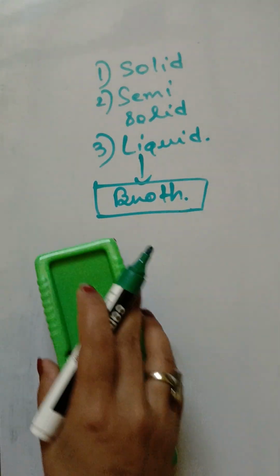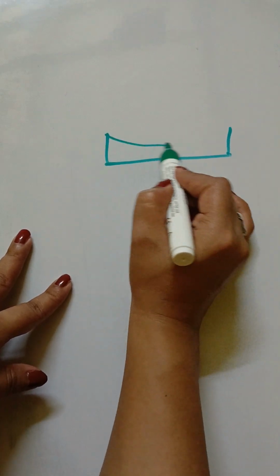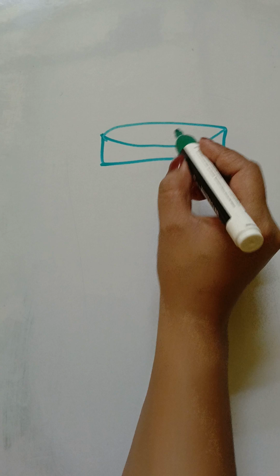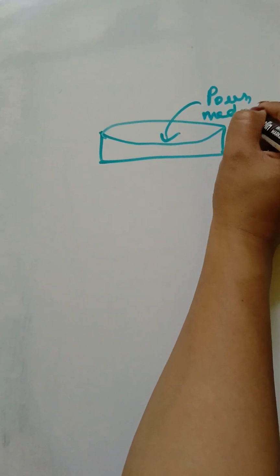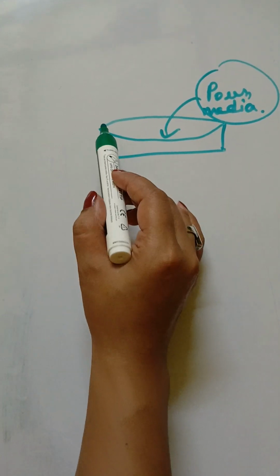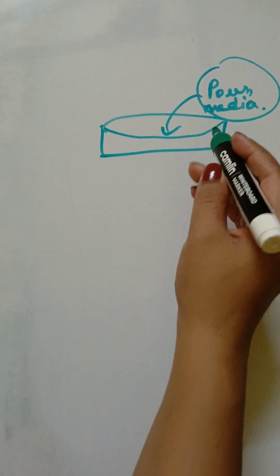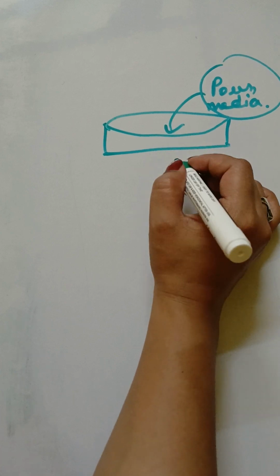But in bacteriology, if you want to isolate some bacteria in a bacterial plate, like this Petri plate, a glass Petri plate or plastic Petri plate, we have to pour the media. If it is a broth, meaning the liquid media, then it will not solidify in this plate, and the media will be wasted. We cannot use this.